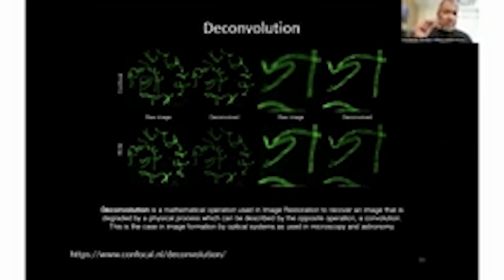And there is a very, very powerful, beautiful tool called deconvolution, which is nothing but a mathematical algorithm that was written to clean up images. So you can take a confocal image and then you can deconvolute it, which means you're not actually changing how you record the image. You're only cleaning up the image as post-processing. After you have recorded the image, you're processing it in such a way that you can now see things that would have been difficult to see otherwise.